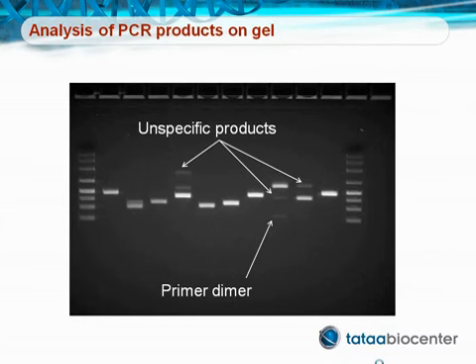If you have several peaks or new peaks in your melting curve analysis, you should also analyze the PCR products on gel. Here you will see if you have a specific amplification or if unspecific products are interfering with your analysis. In this case, we have analyzed several different new primer pairs to find the best couple. In some lanes we can see both several longer bands that are unspecific products and some shorter that may be primer dimers. The primer pairs that give several bands are of course omitted.